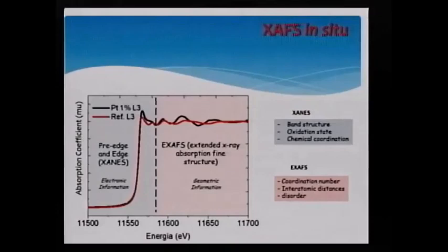But if you continue taking the spectra, you get information about the coordination number of a given atom, the interatomic distance, and the disorder. I think, in my opinion, this is the key technique for your studies. And we hope to get a lot of spectra with a lot of different materials in the series in the next years.